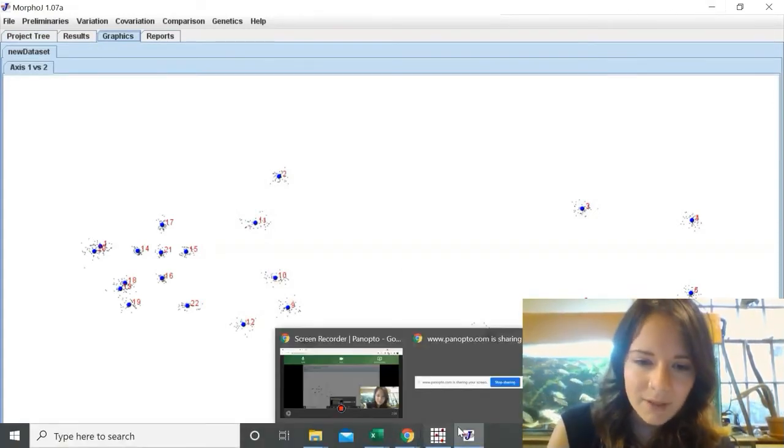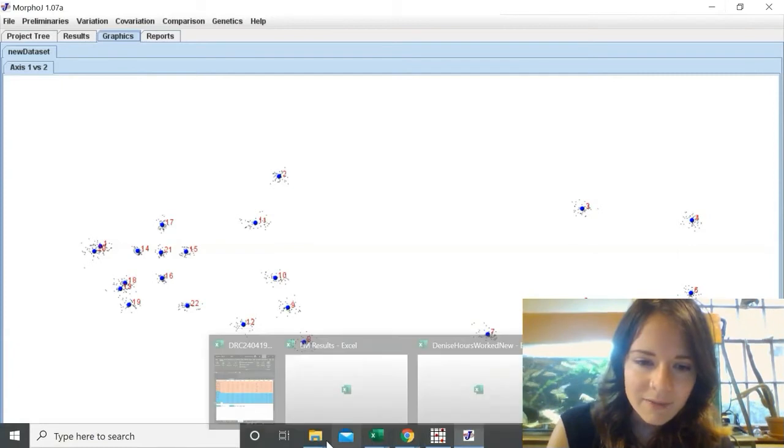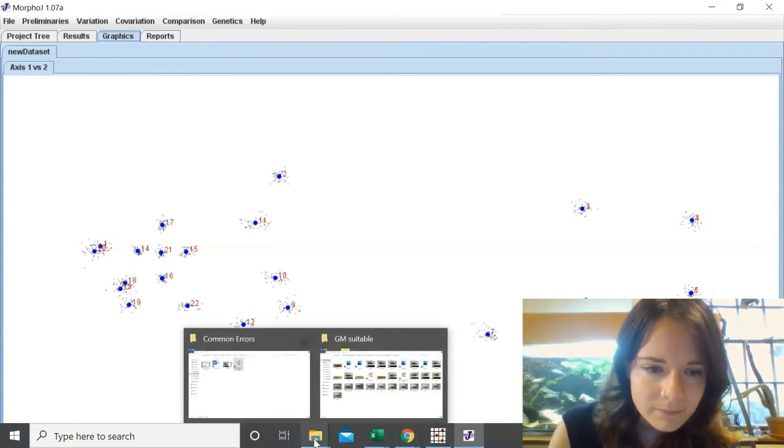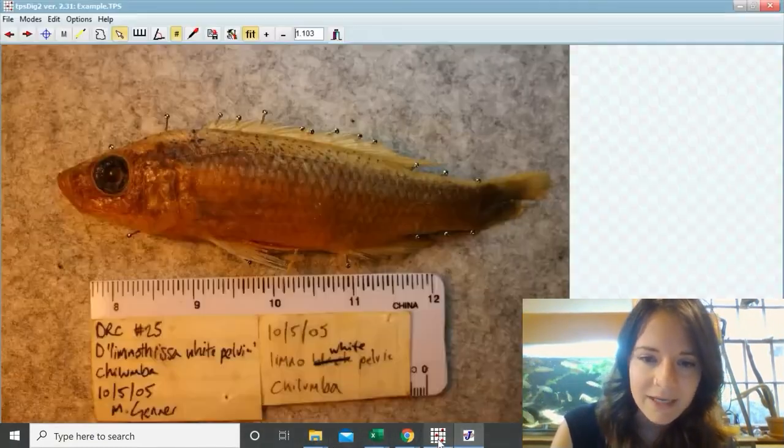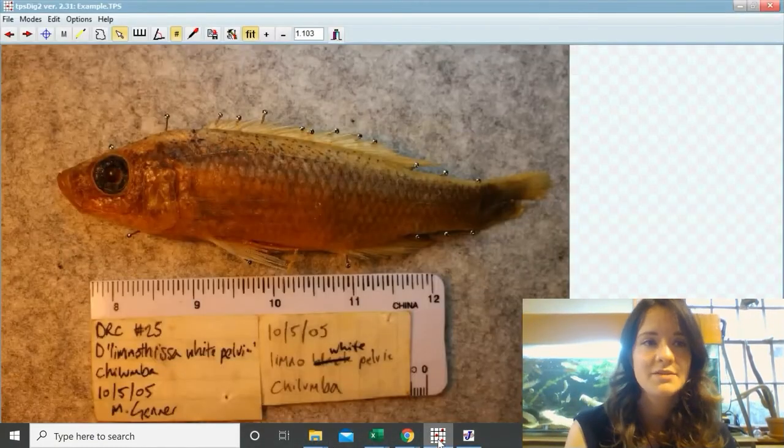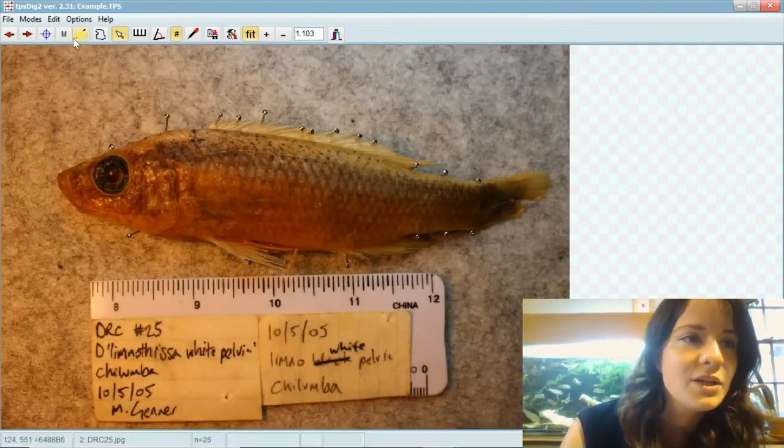The next problem is in TPS dig, or it's more just an annoyance really.